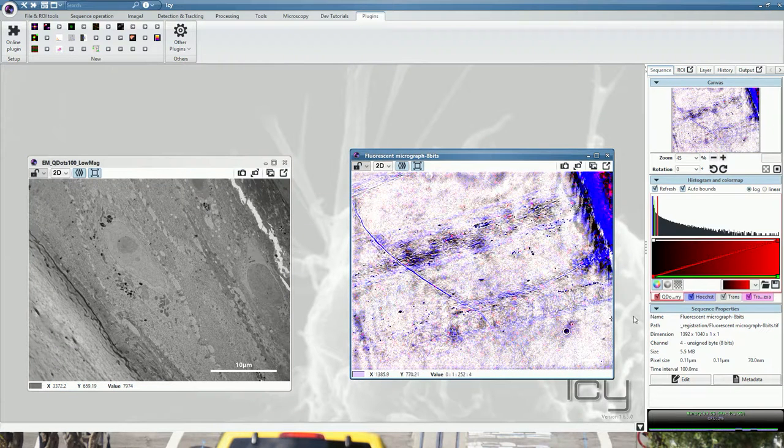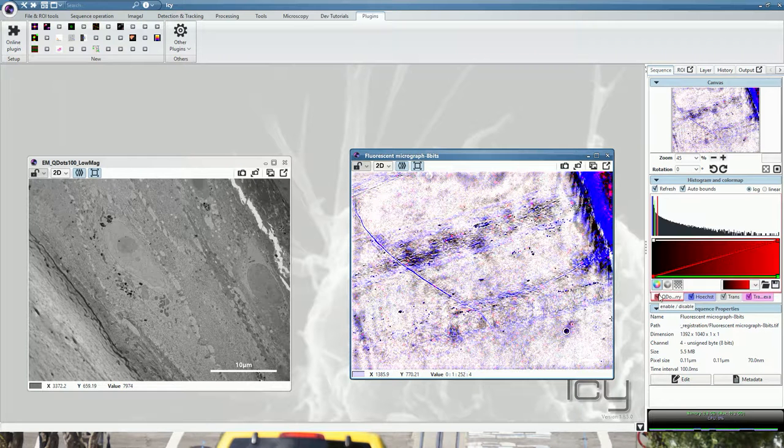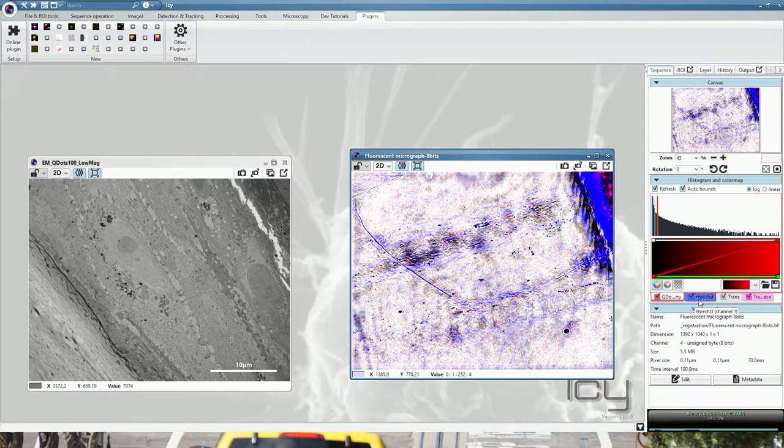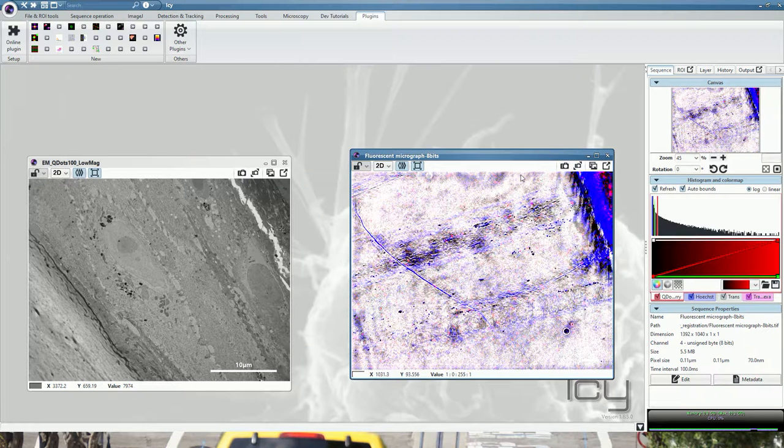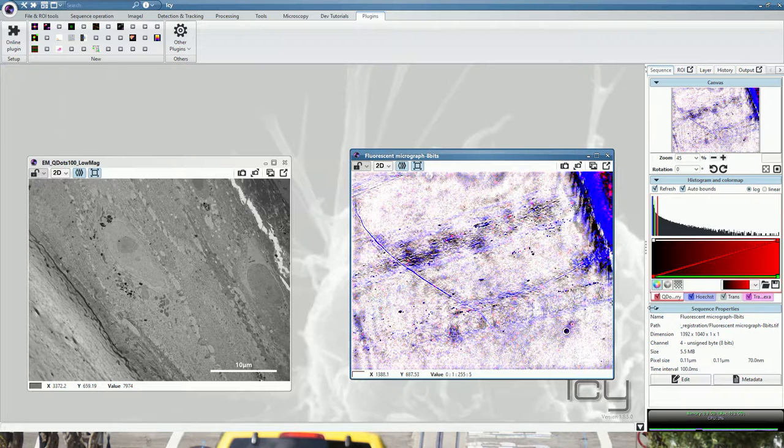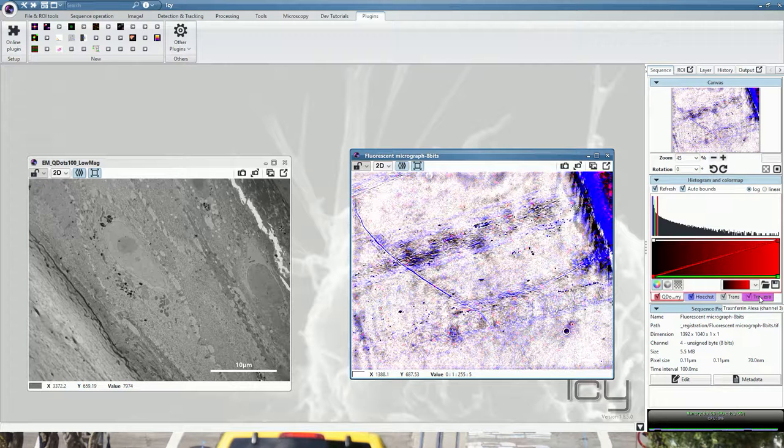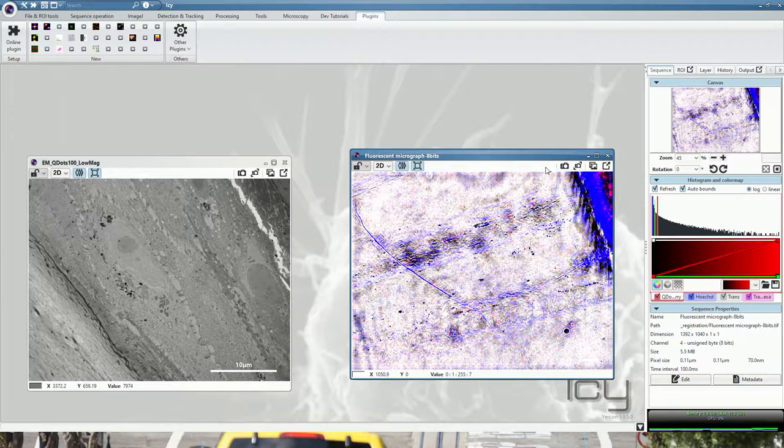You have quantum dot channels containing quantum dot aggregates that will be used later on for accurate registration. We have the Hoechst channel for highlighting the nucleus. Transmitted light will display melanosomes and various cells and layers of the epidermis, and the transferrin Alexa has been used to label the endosomal network of this epidermis.